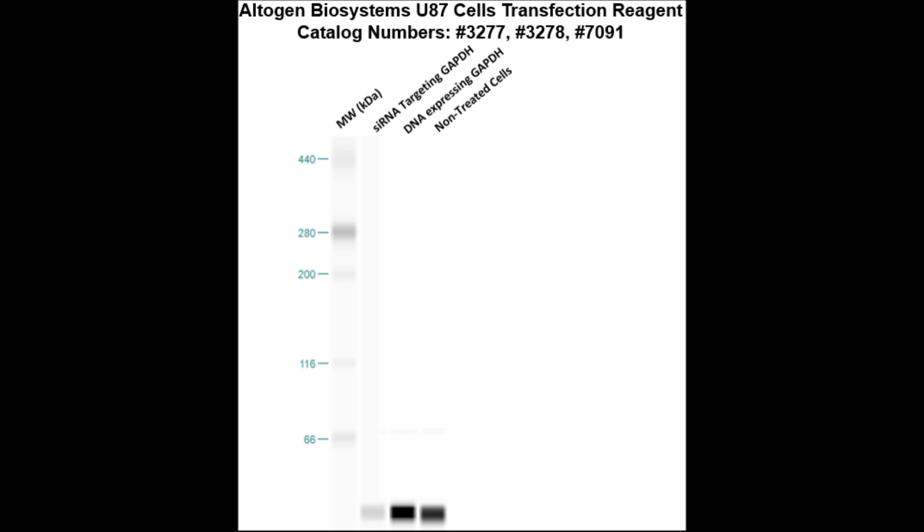Here is a Western blot validation of our transfection reagent. U87 cells were transfected with either GAPDH DNA, which resulted in overexpression as compared to non-treated cells, or GAPDH siRNA, which resulted in partial silencing.